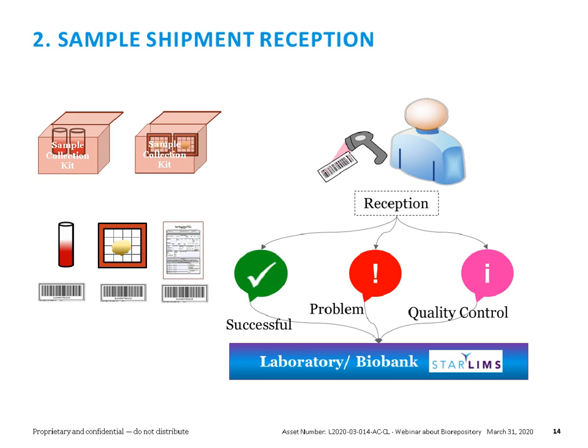So this shipment reception is a process where typically a user is going to have some kind of barcode scanner, and will start scanning the barcode labels. In this case, it could be the shipment barcode label itself. Perhaps the tracking number has a barcode, or perhaps we can also have the kits themselves with barcode labels, or the containers themselves with barcode labels.